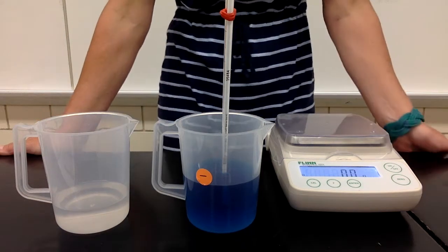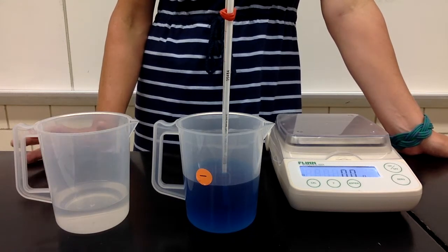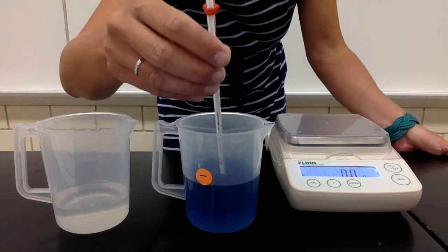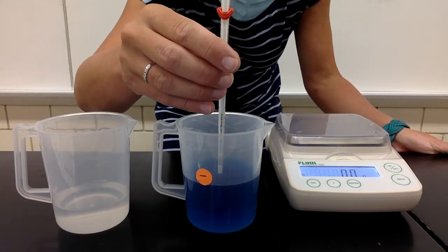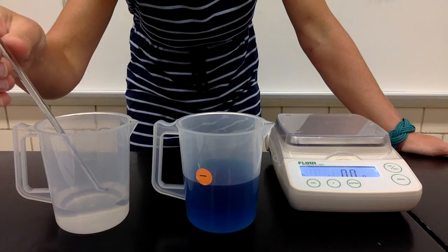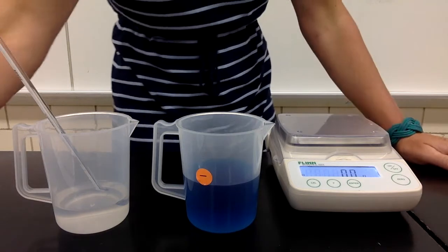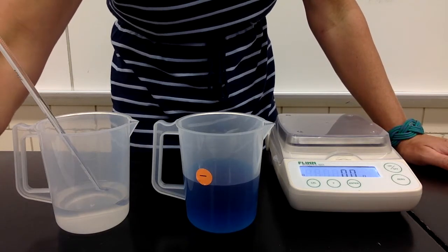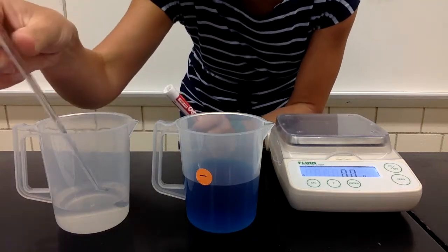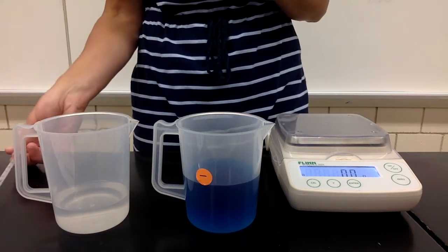I'm starting with ethanol and water before they're mixed together, and before I've even layered them together. I'm taking the initial temperature. They've been sitting in the room, so I'm assuming both of their temperatures are about room temperature. It looks like the water is about 25.5 degrees Celsius. I'm going to leave the thermometer in the ethanol right now while I record the temperature. So water was 25.5 degrees, and it's really not changing in the ethanol at all. So I'm going to say that our starting temperature is about room temperature, which is about 25 degrees.